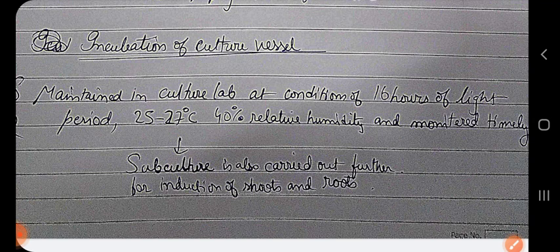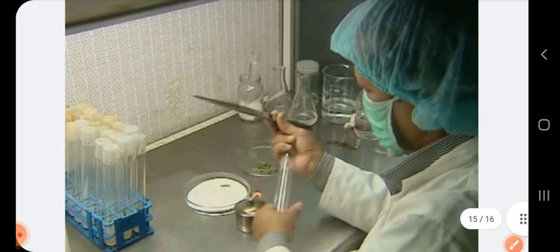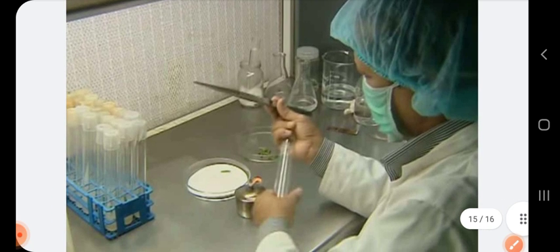Okay, now this picture is taken from a YouTube source where you can see how aseptically this researcher is inoculating the explant into the culture tube in front of a laminar airflow and with the spirit lamp. Generally we use a spirit lamp, but you can also use a Bunsen burner with a low flame, if a setup is available there. Otherwise you can go for a spirit lamp as well.